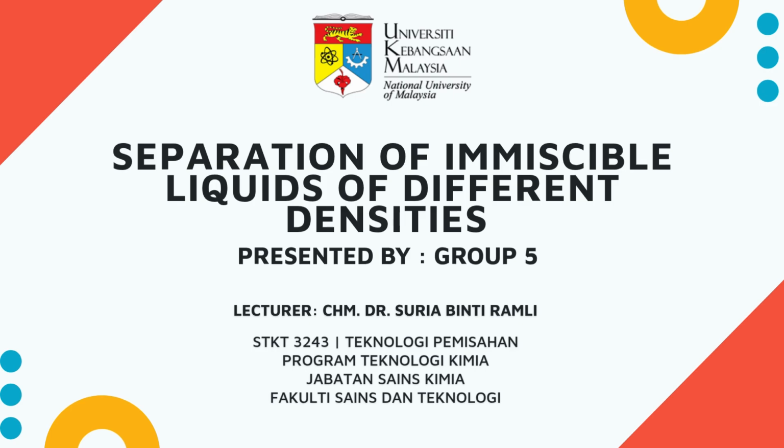Hi guys, so today we will be presenting about separation of immiscible liquids of different densities, presented by Group 5.